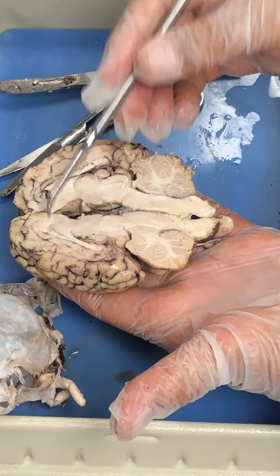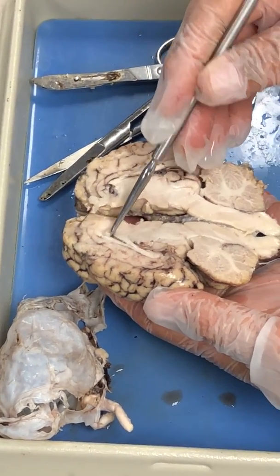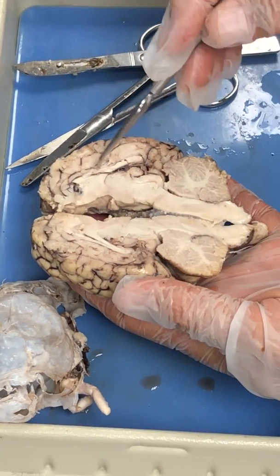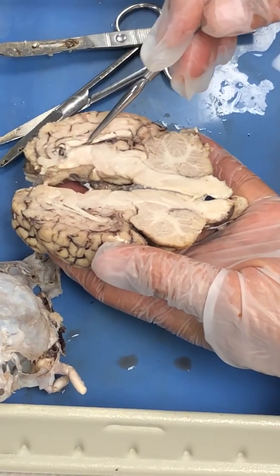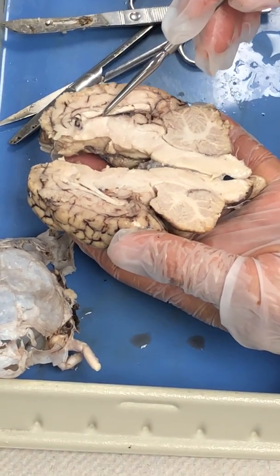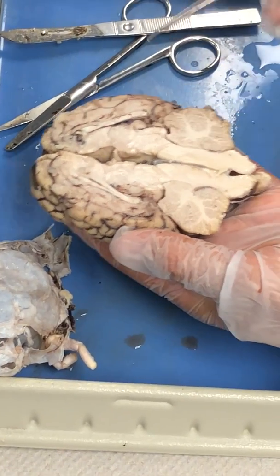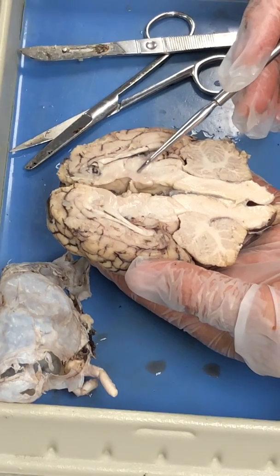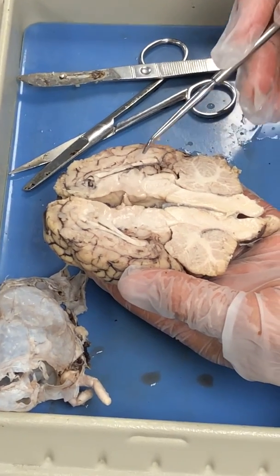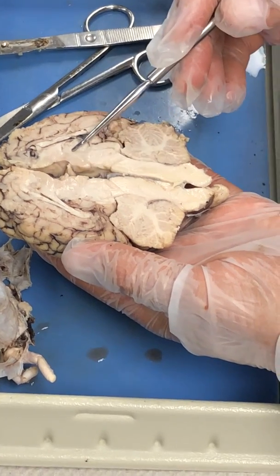So if you go right through it with the probe, that's a cavity. That's a lateral ventricle. And then on the other side, you have the other lateral ventricle. That's where you find the cerebrospinal fluid. This rounded area in here, and this area right in here, that's the thalamus.